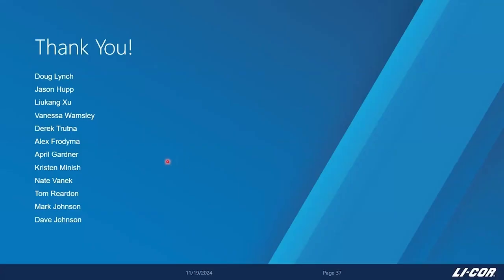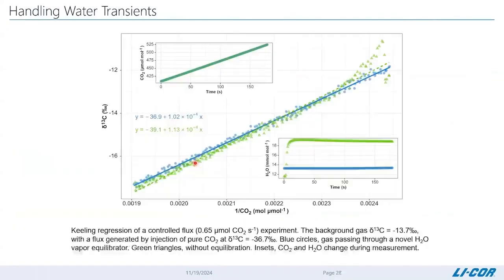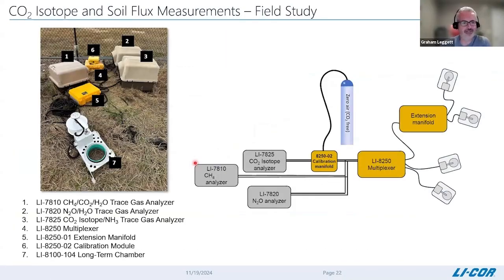I think maybe you can go back to that slide, Graham. There are some nice pictures of some easy ways to weather protect these analyzers in the field using those plastic huts. Let's see, he's going back. Yeah, exactly. There we go. Dog house. Yes. Those are nice solutions to protect the analyzers from the elements.